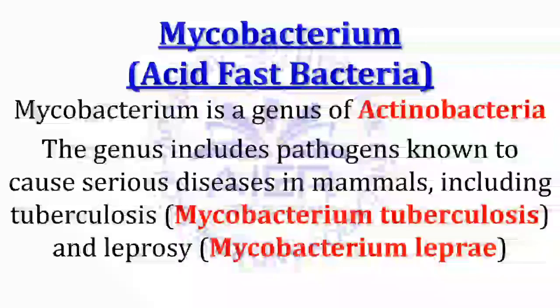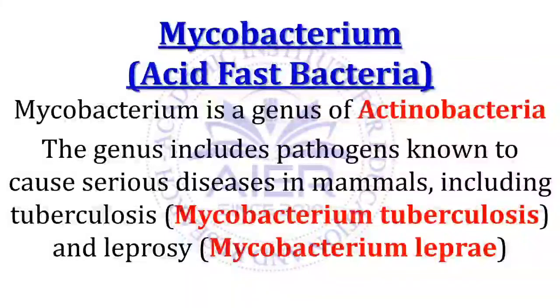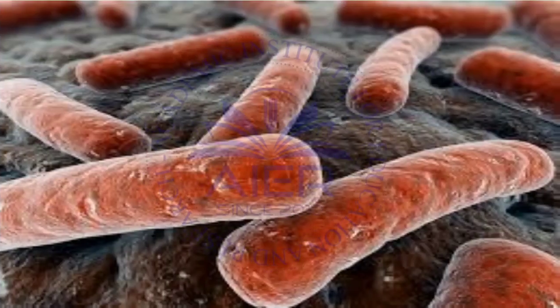Now, Mycobacterium, or acid-fast bacteria. Mycobacterium is a genus of the Actinobacteria. The genus includes pathogens known to cause serious diseases in mammals, including tuberculosis, caused by Mycobacterium tuberculosis, or leprosy, caused by Mycobacterium leprae. Now there is a diagrammatic representation of this kind of mycobacteria.